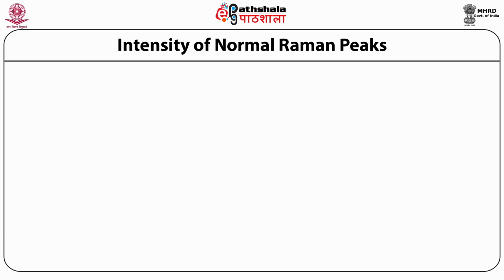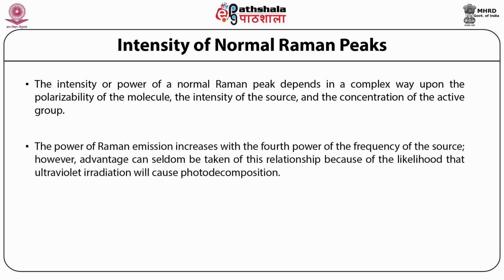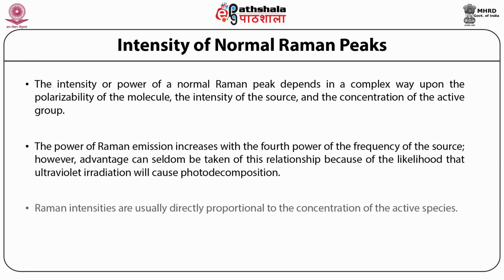Intensity of normal Raman peaks. The intensity or power of a normal Raman peak depends in a complex way upon the polarizability of the molecule, the intensity of the source and the concentration of the active group. The power of Raman emission increases with the fourth power of the frequency of the source. Raman intensities are usually directly proportional to the concentration of the active species.